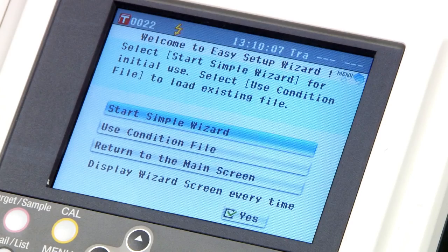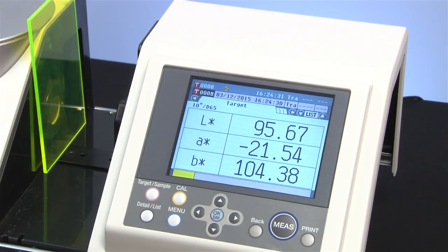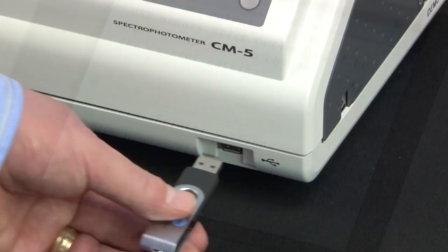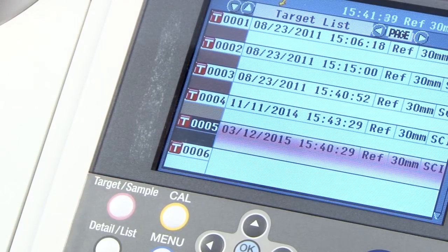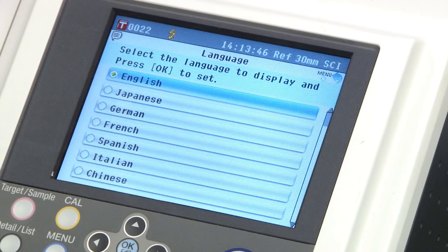With an easy-to-use wizard mode, measurements are performed by everyday users or occasional users alike. Stored data can be saved to a USB drive, making it easy to switch users and save settings without going through manual setup each time. In addition to the USB feature, the CM5 can store 4,000 measurements and 1,000 target colors in its large memory. You can even switch language settings.